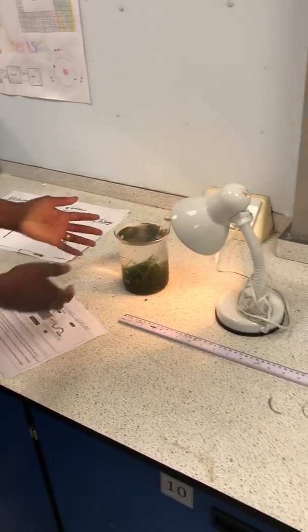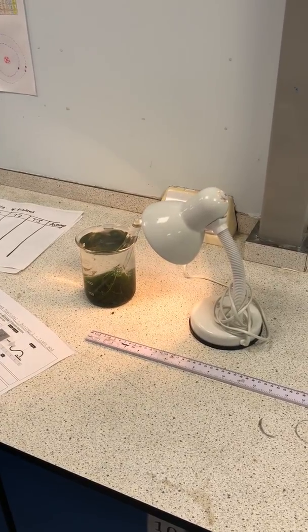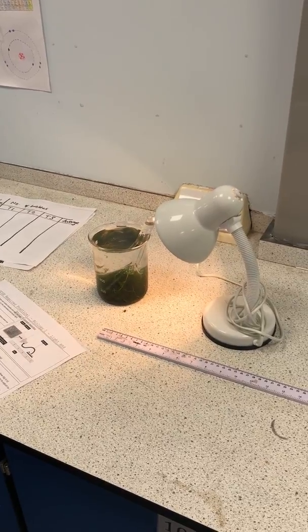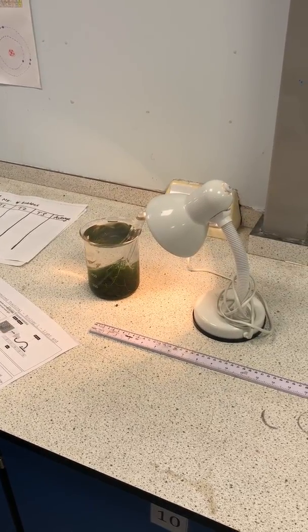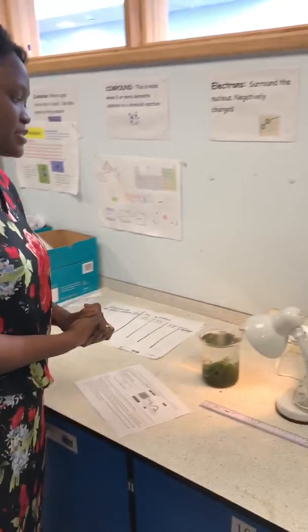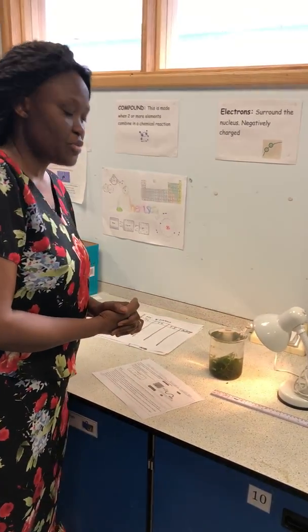We have here a plant, an Elodea plant, or duckweed, which is a pond weed, which grows in water. Now this plant is useful for investigating photosynthesis because right before our eyes we can see, in the form of bubbles, when the gas is being released.